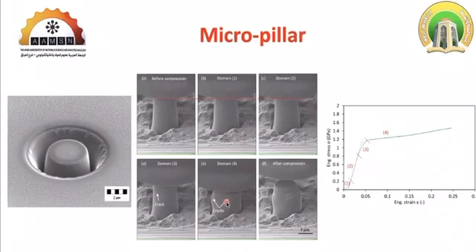This is also synchronized with recording data from the nanoindentation, so the outcome of the machine is a high precision stress strain curve, and a whole recording of the test, imaging or video recording of the test from time zero to the fracture occurrence.